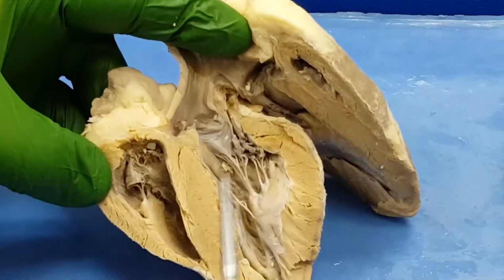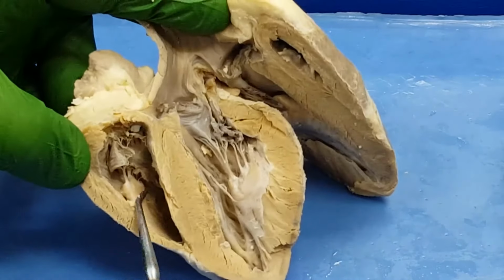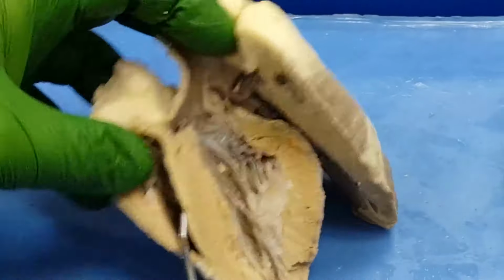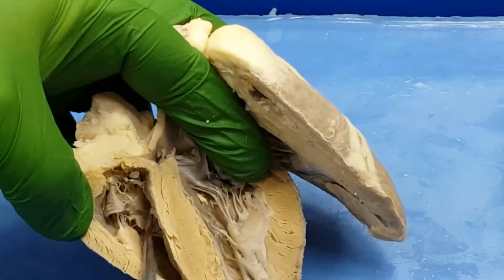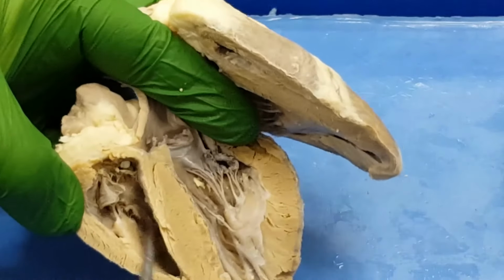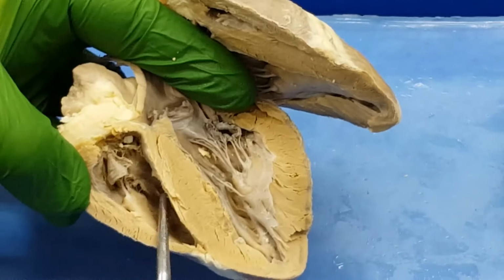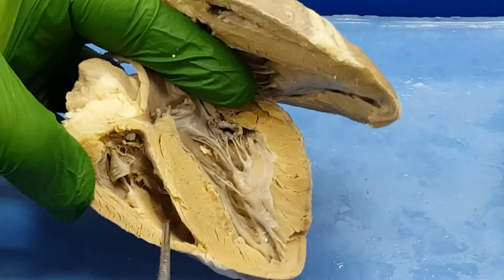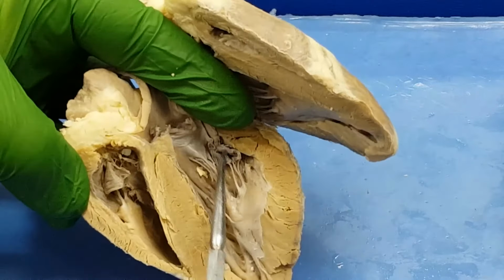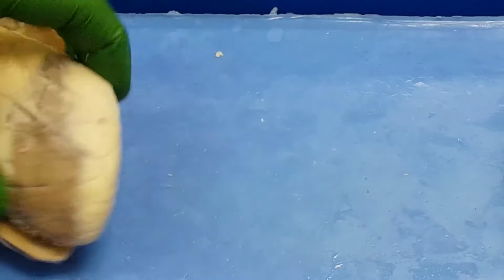What would I see at the top of the right ventricle as I expand it with my hands here? Can you see the cords in there? See the cords? And the flap, this would be the tricuspid valve that my probe is on right here. This is the tricuspid valve separating the right atrium from the right ventricle. So I can see those 2 valves pretty easily on this heart.